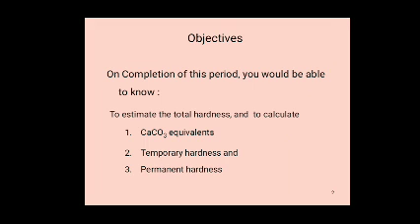Degree of hardness of water is expressed in terms of equivalent weight of calcium carbonate.